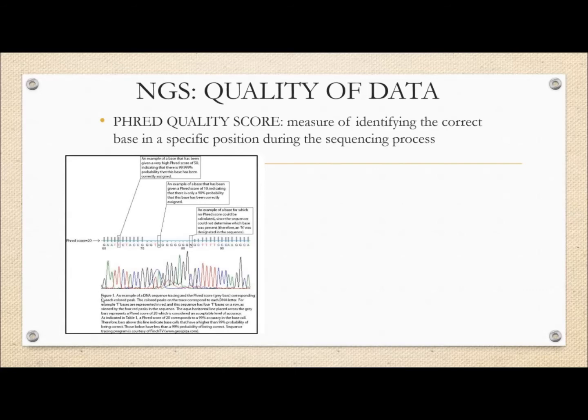Now, look at this picture. Remember, these things are color coded. So for example, T's are red, C's are blue, G's are black, and A's are green. And so what you'll see here are relative probabilities. So for example, I say this is a G, so this is a peak for G, and it looks like a pretty strong probability. Then A and A is pretty strong. Now, remember, this graph literally gives you the probability of A, C, T, and G.